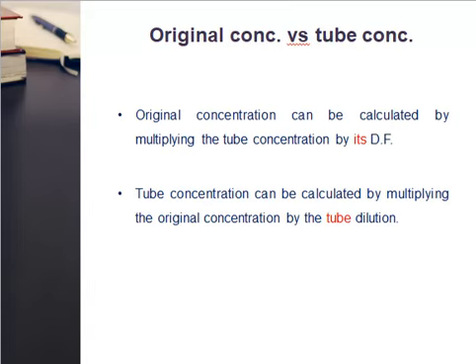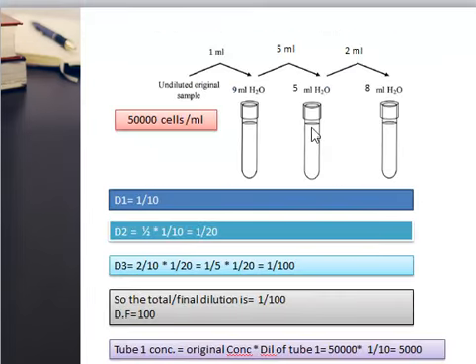So I can calculate the concentration of tube 2 and tube 3 the same way I did for tube 1.